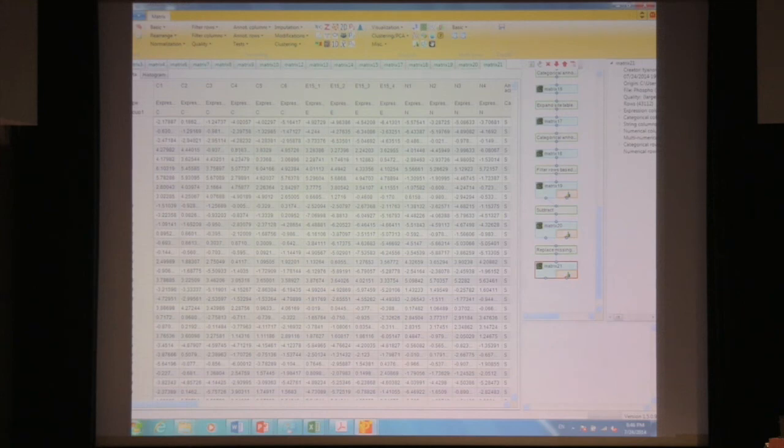Okay, I have a question. Could there be a function added so that you can see the values which are significant just from the imputed values? Especially if you demand to have 4 valid values in just one group, you then have 8 imputed values, and it happened to me that I had significant values just from the imputed groups. Could a function be easily added so that they are taken out of the significant values or highlighted? Yeah, well, that's the nice thing. Now we have this underlying matrix which is imputed, so that could easily be done.